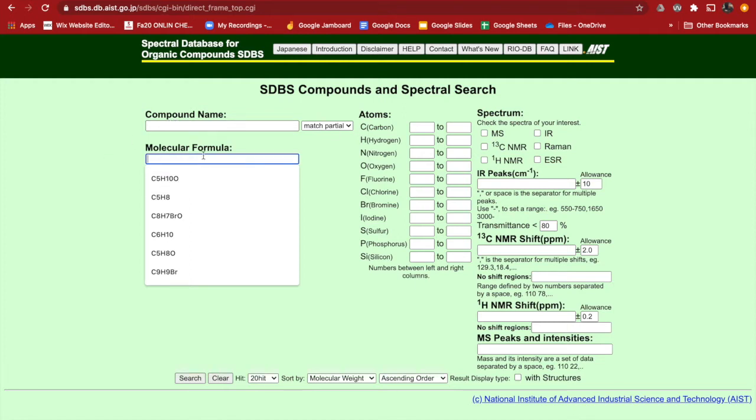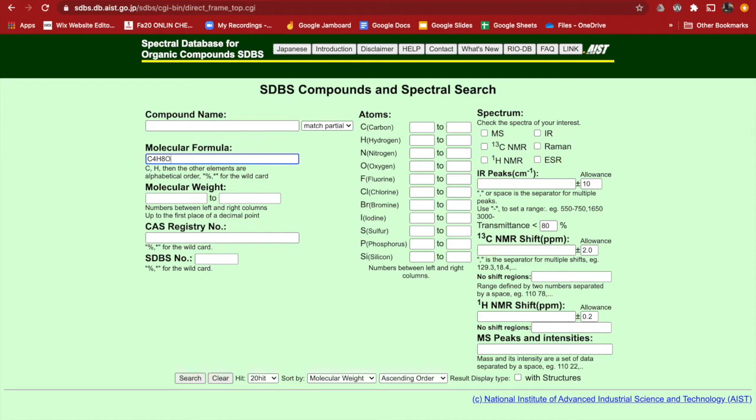But here, let me try one. Let's try C8H... Let me guess. No, I'll make it easier. Let's go C4H8O. Let's try that.